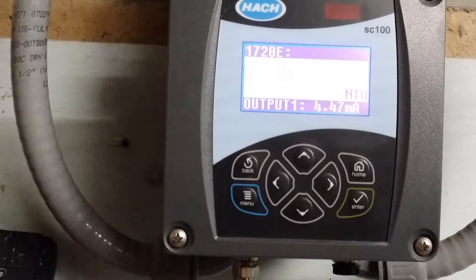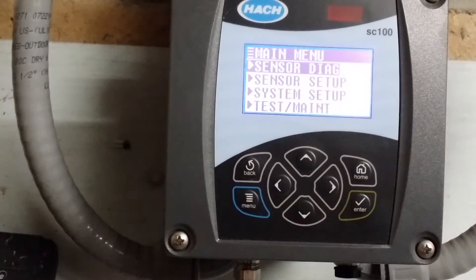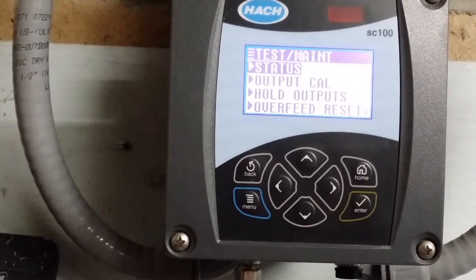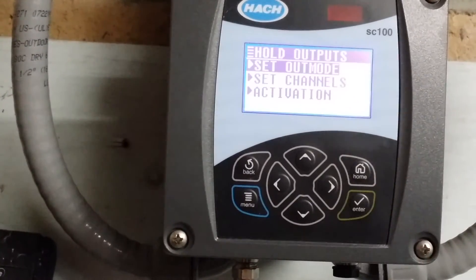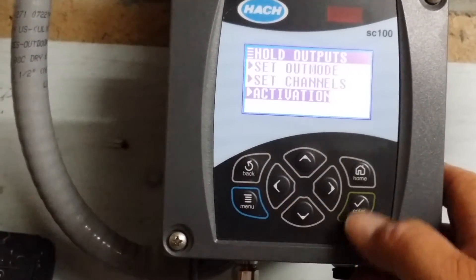After you perform your maintenance, you will then go back to the menu bar. You will scroll down to test maintenance and hit enter. In the test maintenance screen you will scroll down to hold outputs and hit enter. In the hold outputs screen you will scroll down to activation and hit enter.